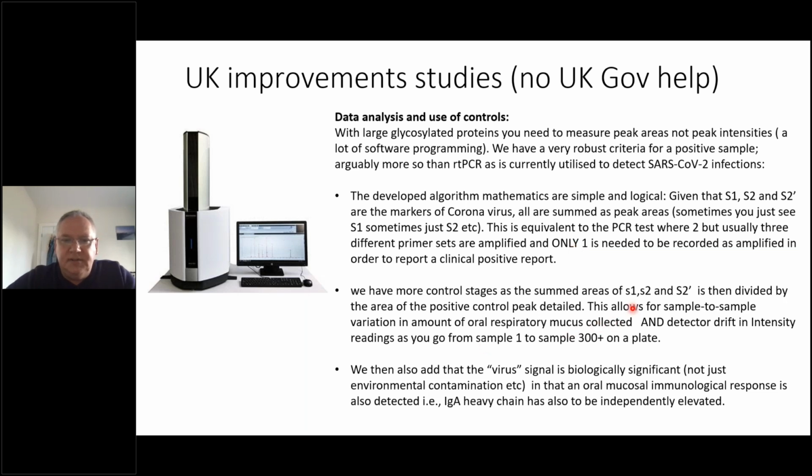And our controls really started to get us a handle on how good the sample was, and if there was any detector drift, because you do get detector drift as you're going across many, many samples. We also had the additional control of whether there is an oral mucosal immunological response going on as well as detecting these markers of the virus. At the moment, I'm quite pleased with myself, but ourselves, but we'll see how things develop.